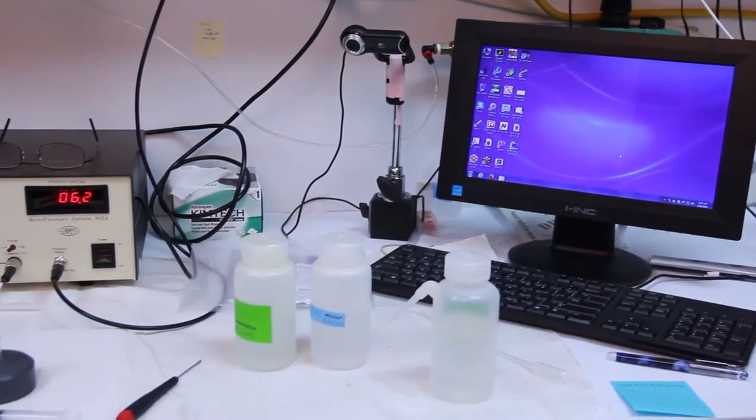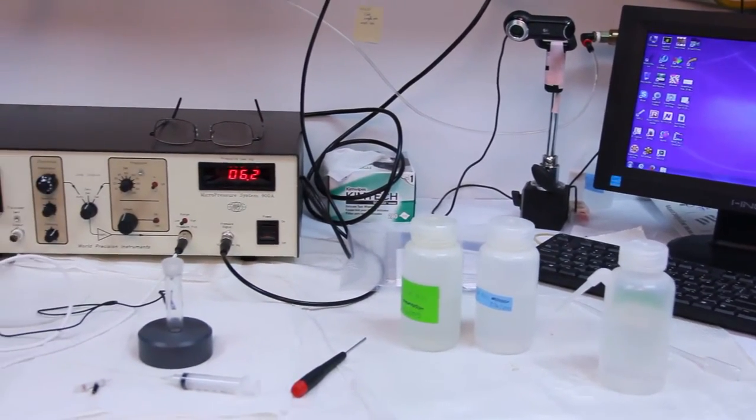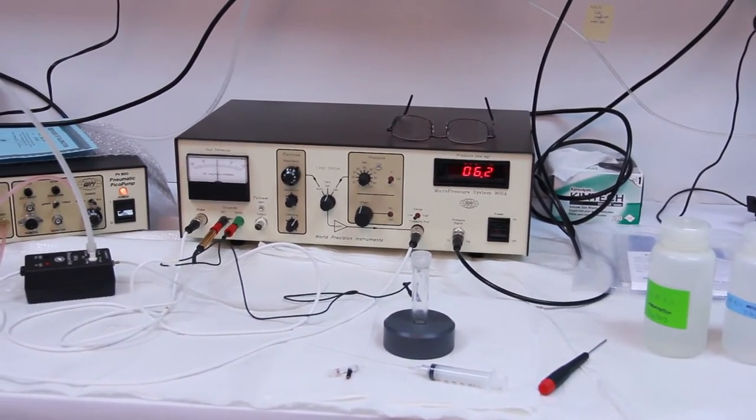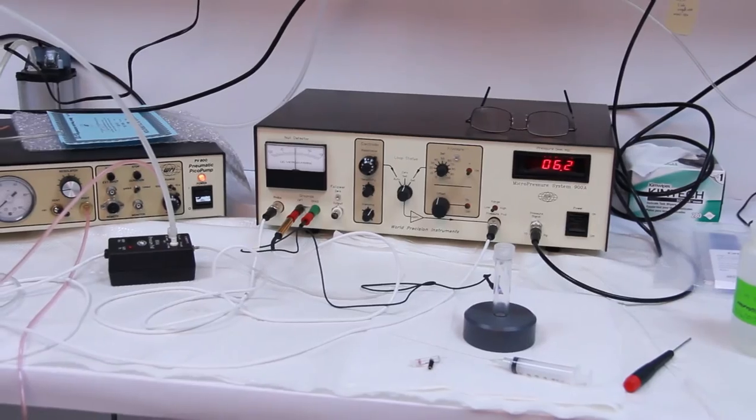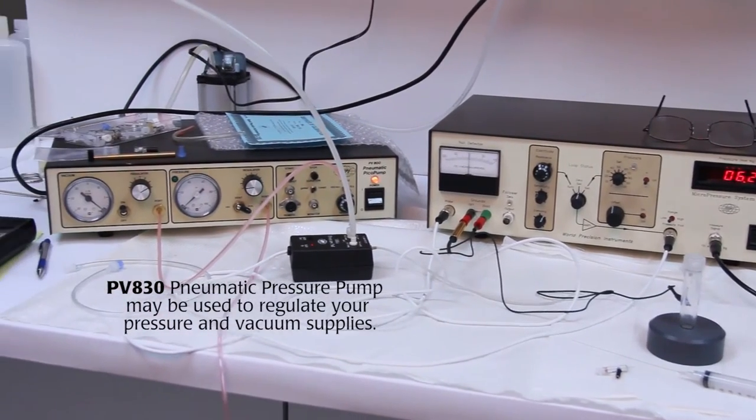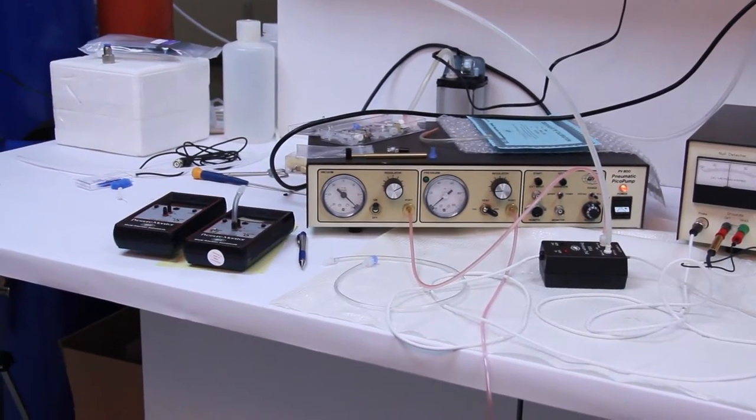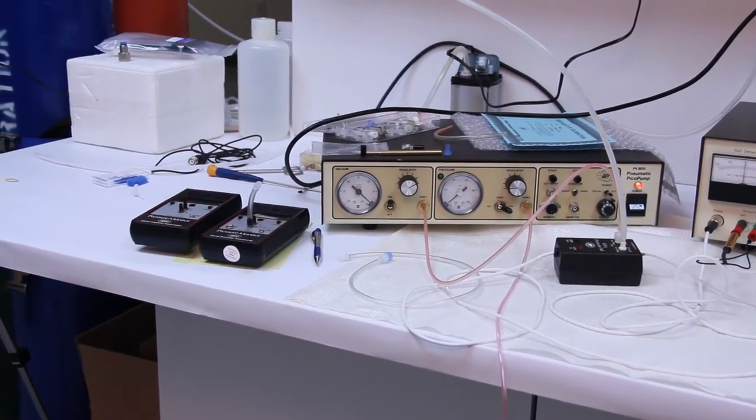The pressure reading appears on the front panel display and via the BNC recorder output. Because the piezoelectric pressure controller uses external pressure and vacuum sources, pressures lower than minus 200 to greater than plus 400 millimeters of mercury can be quickly and accurately measured at the microelectrode tip.